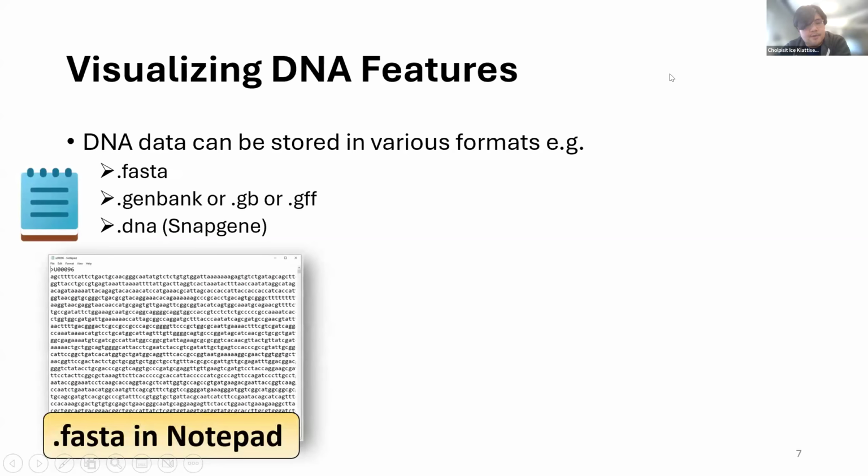So what I'm trying to show you here is the DNA that represents the genome of E. coli. So they have this kind of code saying U00096. These are the code of bacterial DNA, in which these DNA will just get translated into RNA and protein and show the function later on.